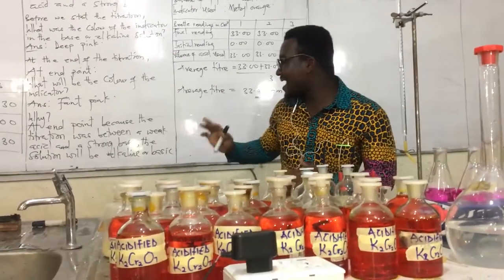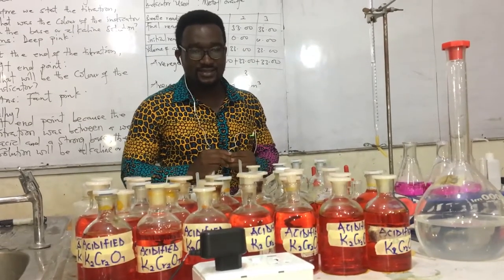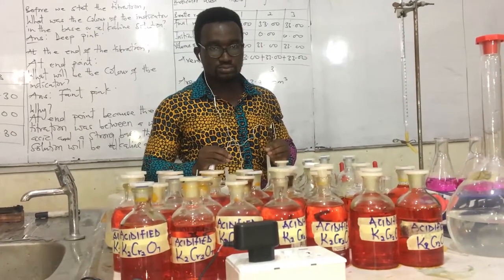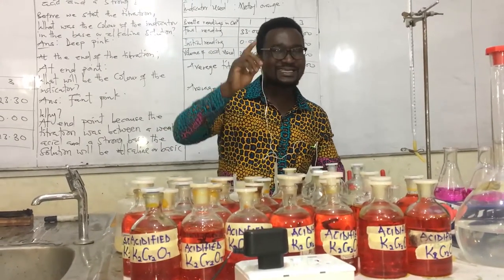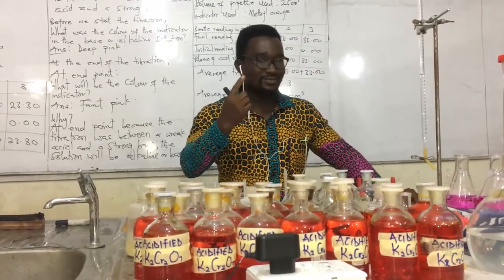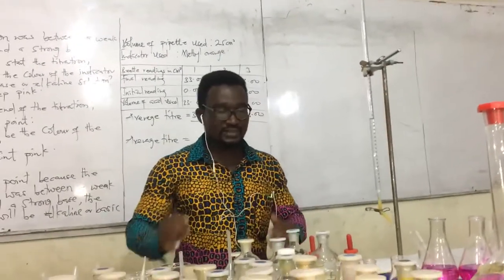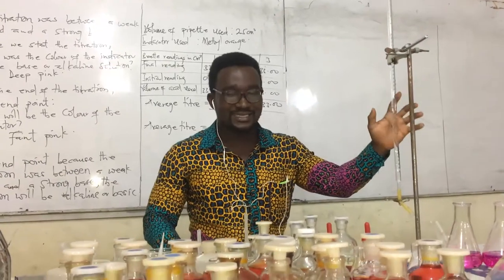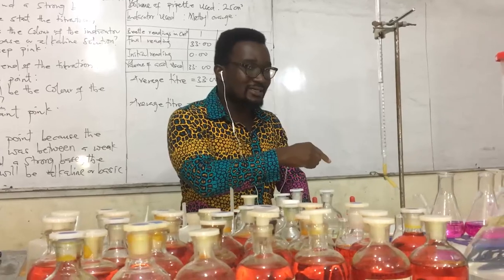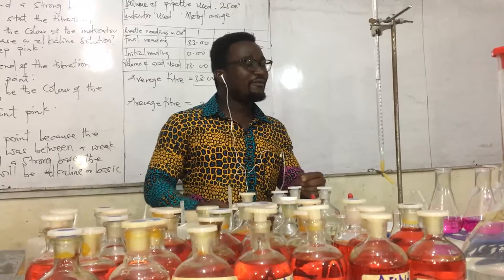Now the theory behind it, why? At the end point, because the titration was between a strong acid and a strong base, the solution would be what? Neutral. The solution will be neutral, except the color change goes to red when you have run more volume of the acid. I'm also interpreting the various forms of challenges that you may get. When you run more of the volume of the acid than the base, you will get the indicator moving backwards to form a red color. So the indicator will be red in there.